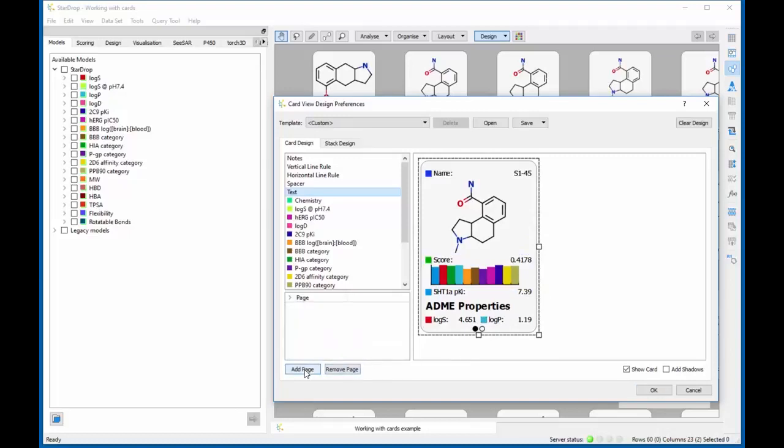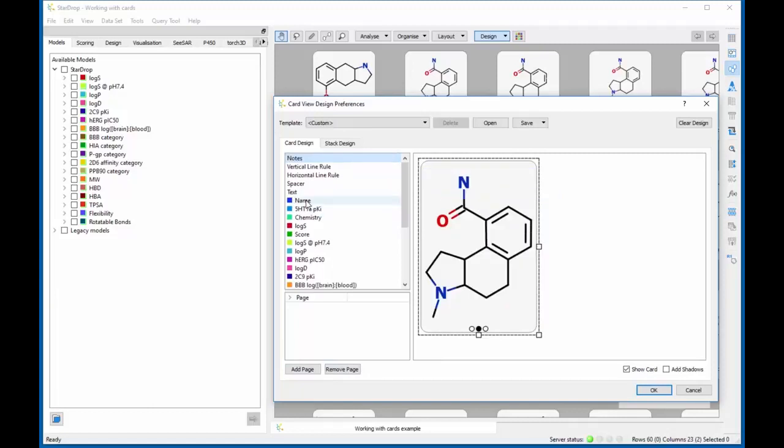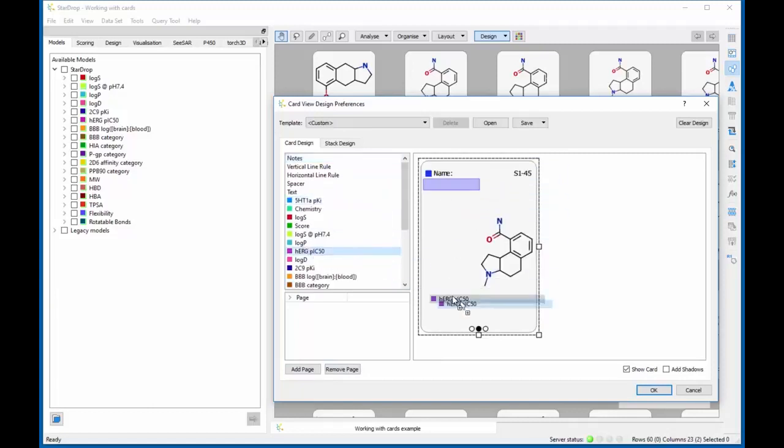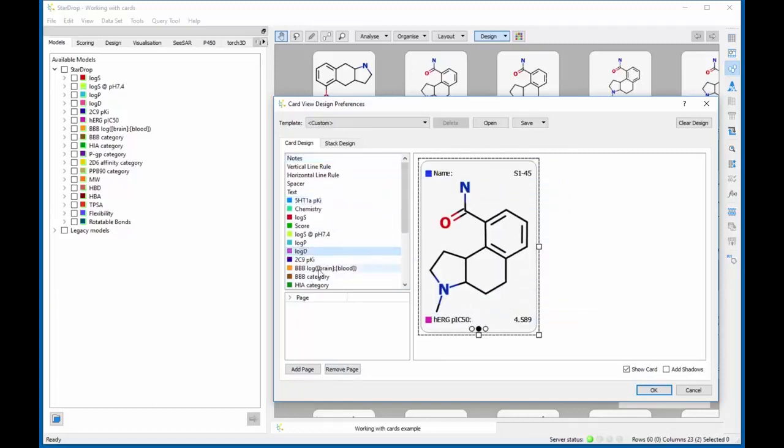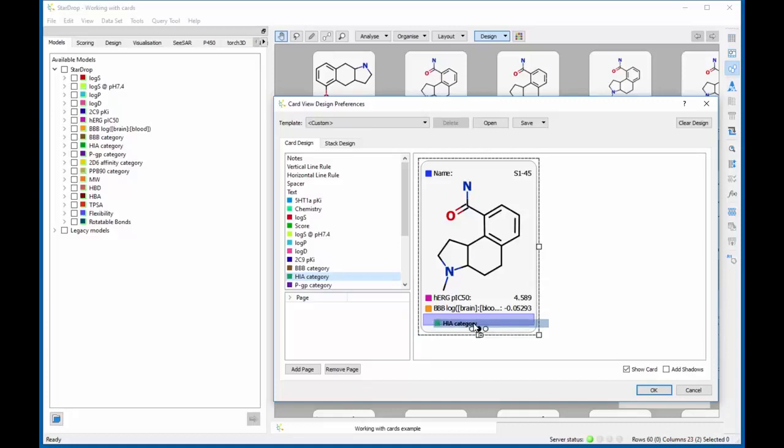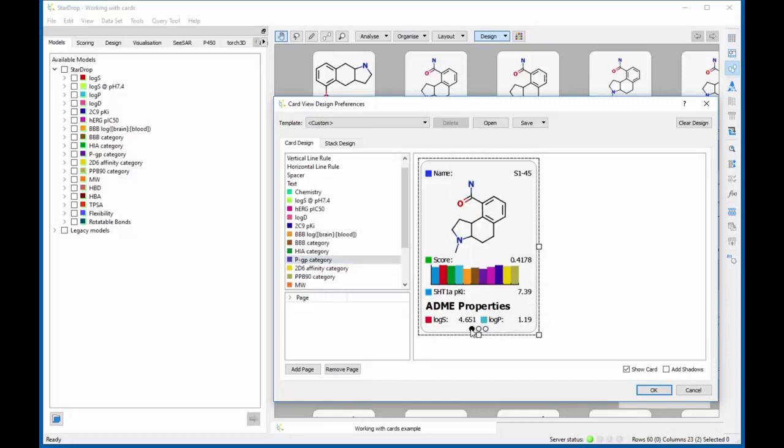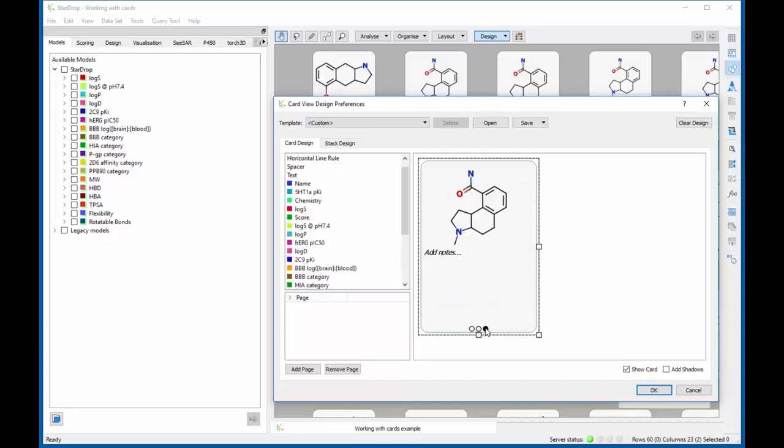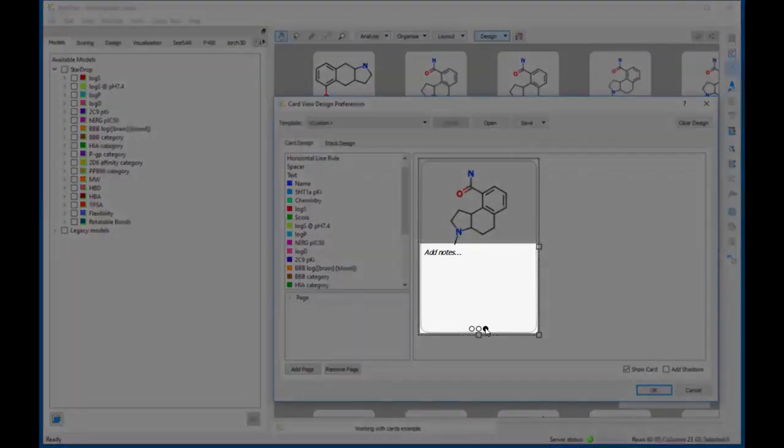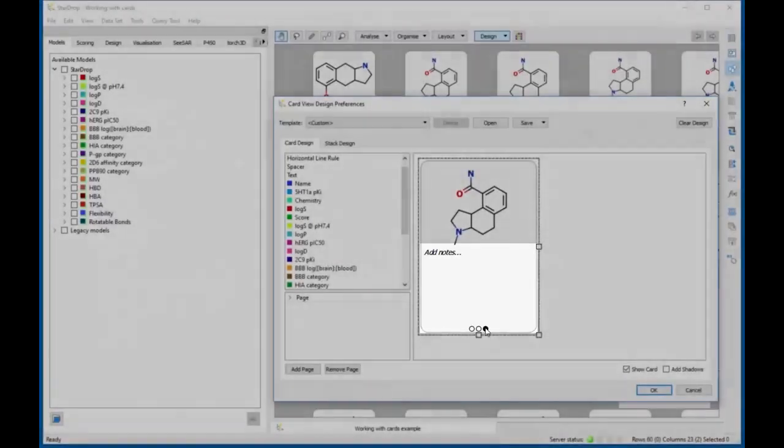Additional pages can be added to a card design containing further information, and you can switch between pages using the circles at the bottom of the card. One of the available options is to include a notes field you can edit individually for each card to annotate your compound.